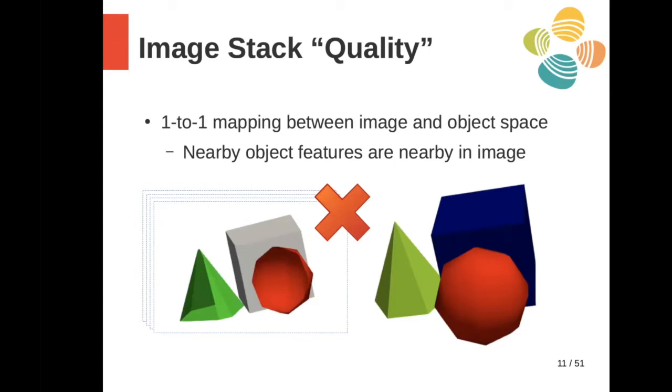An example of this might be electron microscopy, where you've seen beautiful images of insects, for example, and you can see the antennas and the mouth and the body all in the same image. It's like a photograph. Basically you have a 3D object projected onto a 2D plane.